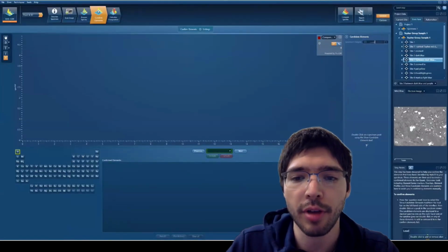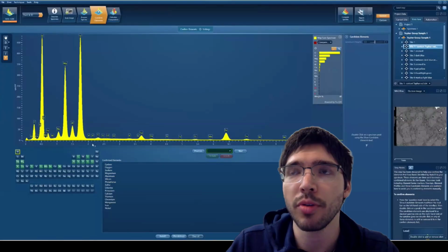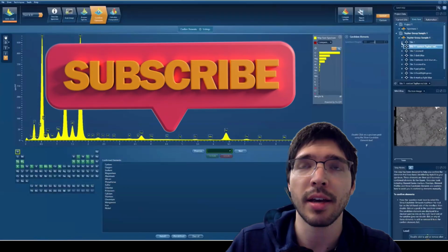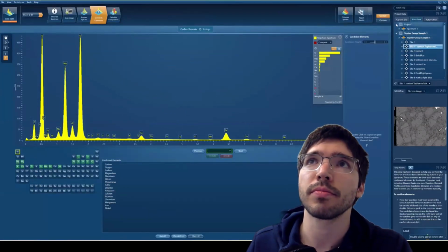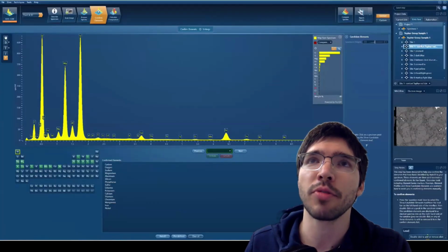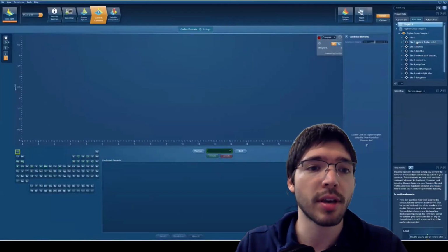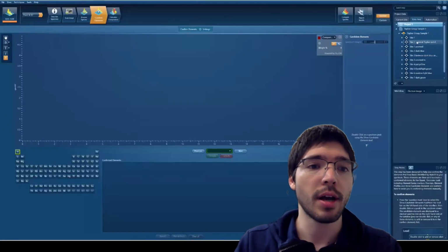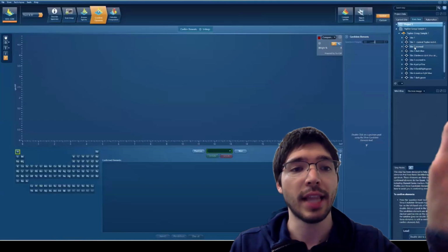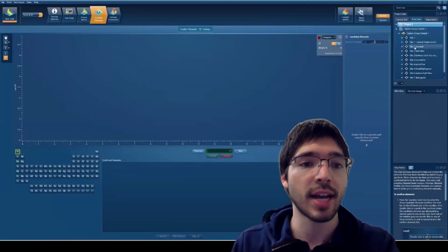There are other programs run by other organizations, like, let's say if you were using a Zeiss SEM, there's another program. I'm trying to remember the name off the top of my head. I used it a few years ago, but there are several different programs that you can use. This isn't the only one. But what's good about Aztec compared to other SEM data processing softwares is that it's all collected in this live time where you can collect an image, store the image, and collect the sites and store those.